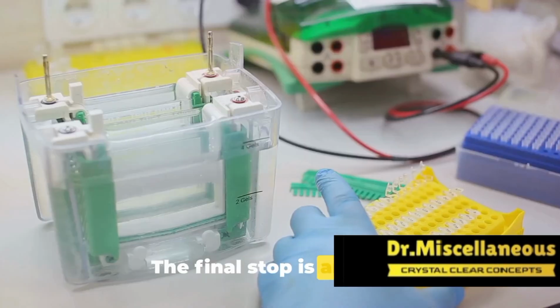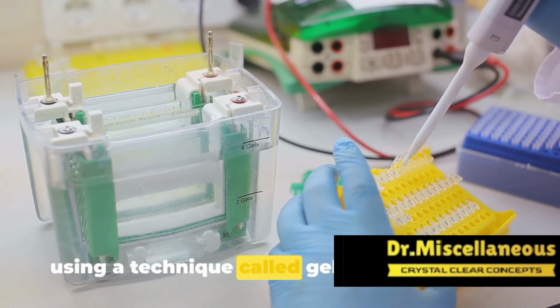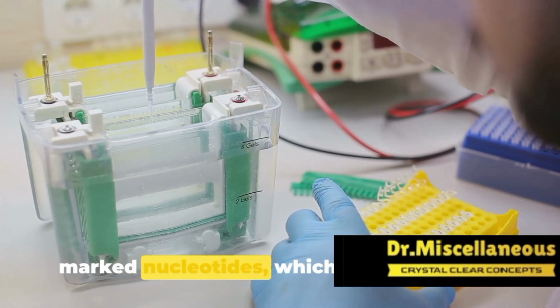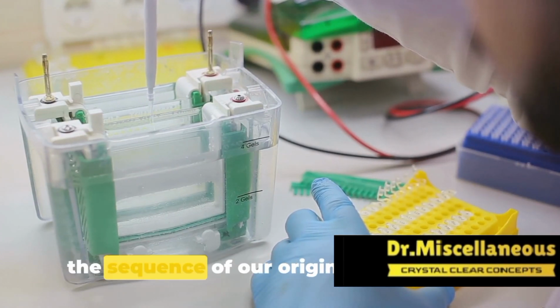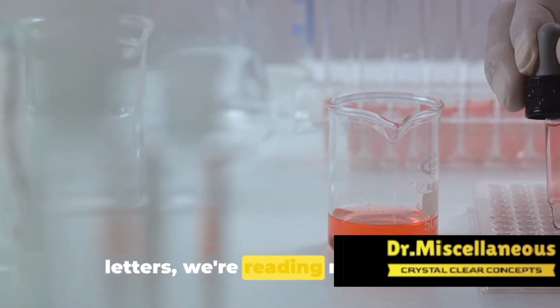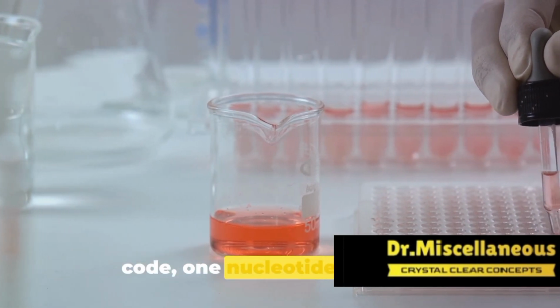The final stop is analysis. We separate these DNA fragments by size using a technique called gel electrophoresis. This allows us to read the sequence of marked nucleotides, which in turn gives us the sequence of our original DNA sample. It's like reading a book, but instead of letters, we're reading nucleotides. And that's how we unravel the genetic code, one nucleotide at a time.